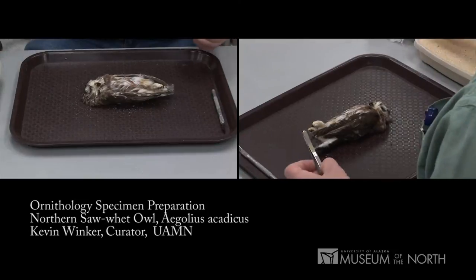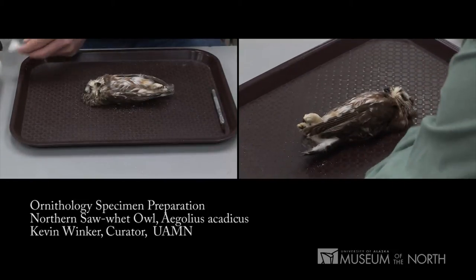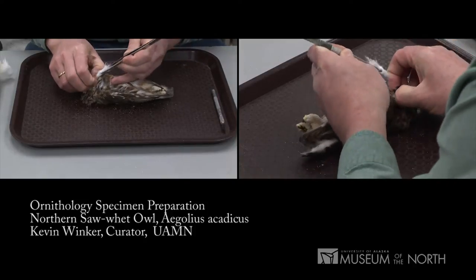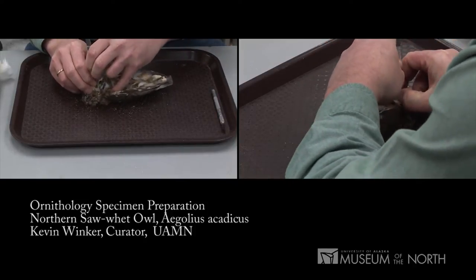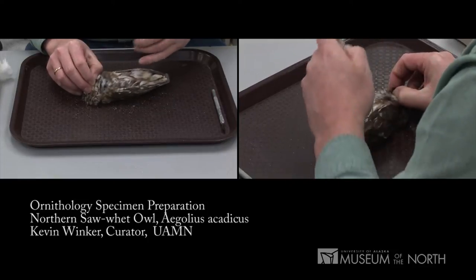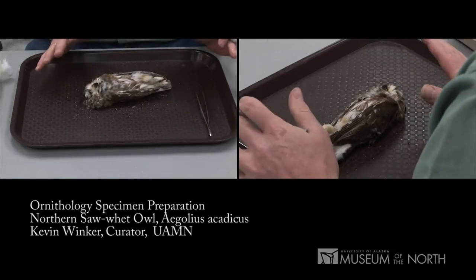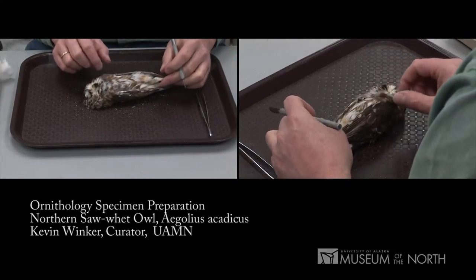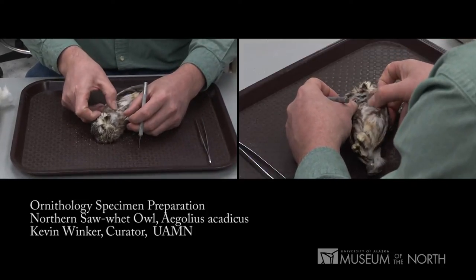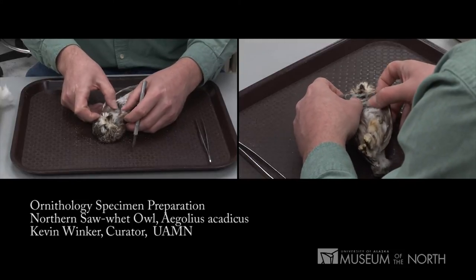Before I actually prepare it, I'm going to take some absorbent cotton and put it down the throat. One of the key things about preparing a bird is that you don't want body fluids to get onto the feathers — if they do, they gum those feathers up and they lose their shape and color. You can wash the bird, but it's much more laborious, so we'll try to prevent that. I've put cotton down the throat, weighed it, measured it, and got tissue vials labeled.